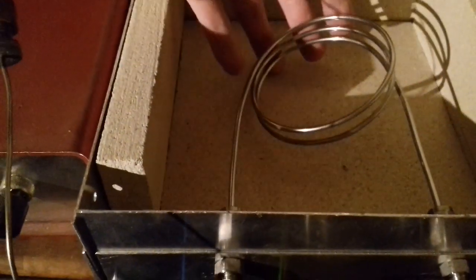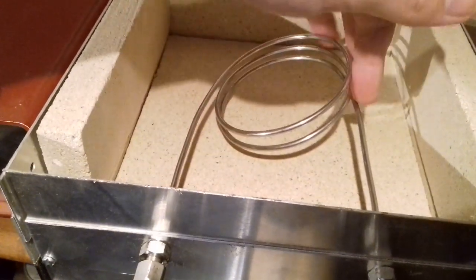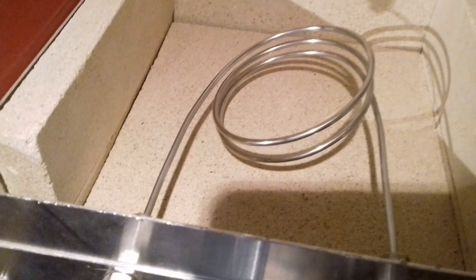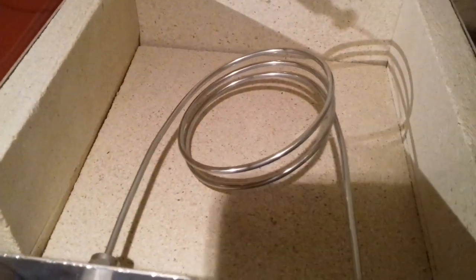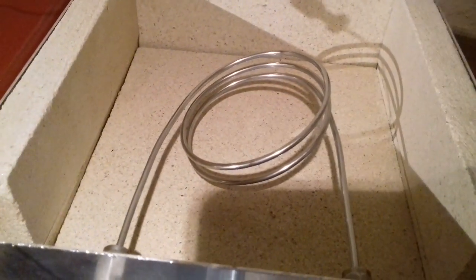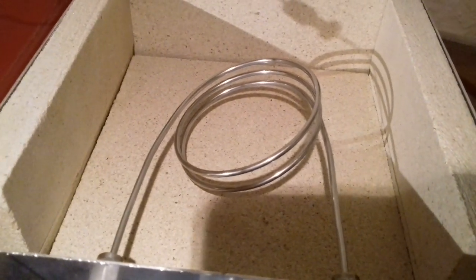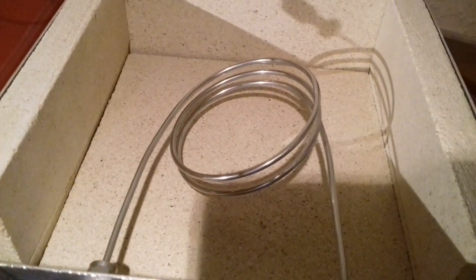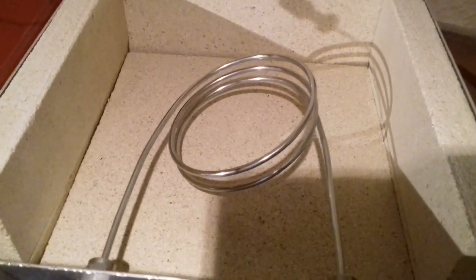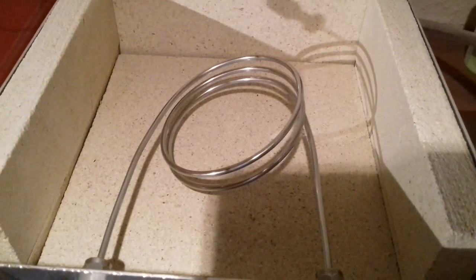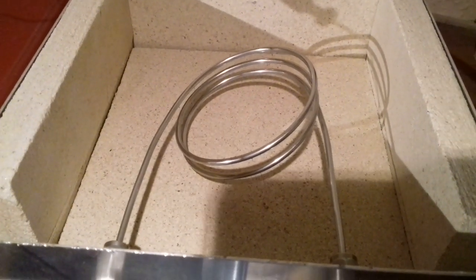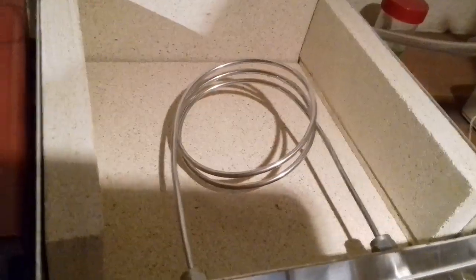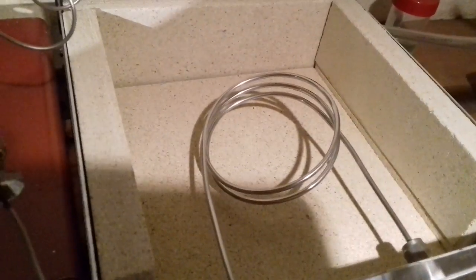This is the column, which does the actual separation. It's packed with crushed bentonite clay from cat litter, 80 to 100 mesh. That is the very old-fashioned way of doing gas chromatography - simply having a packed column of some kind of adsorbent. It could also be alumina or silica. Slightly later, they started to coat it with different things. I'm going to try that too. In fact, I've tried both Vaseline and candle wax. Both work okay.